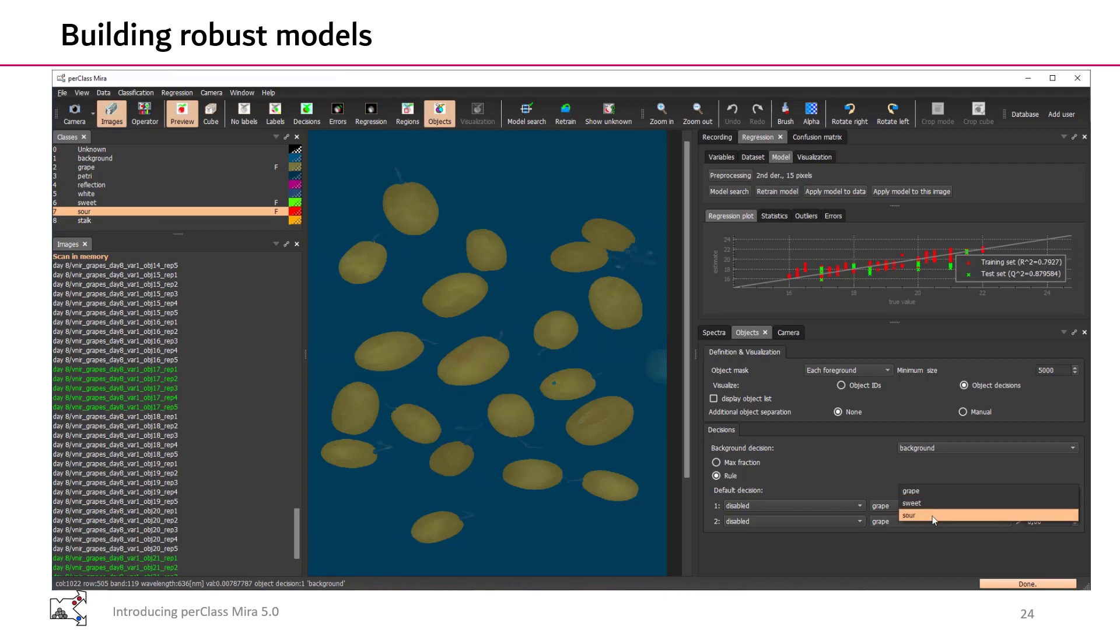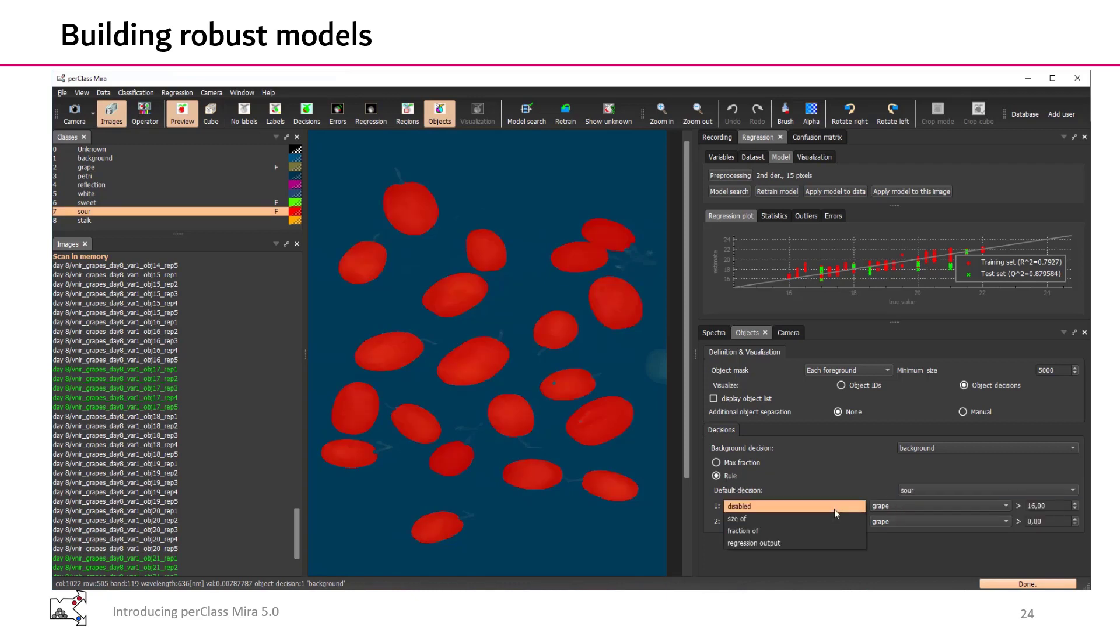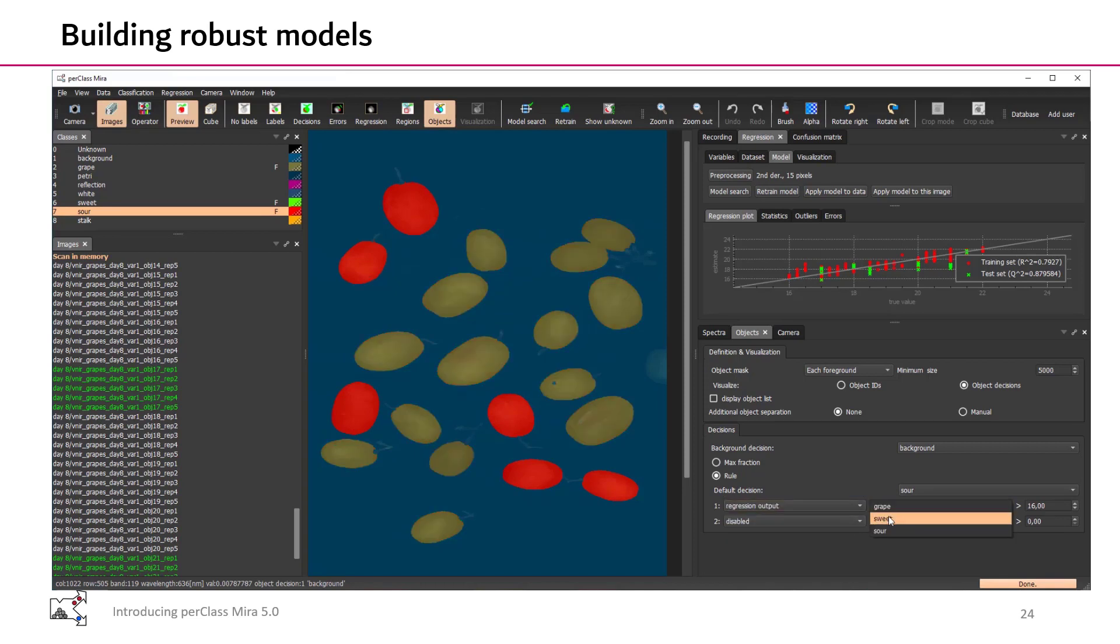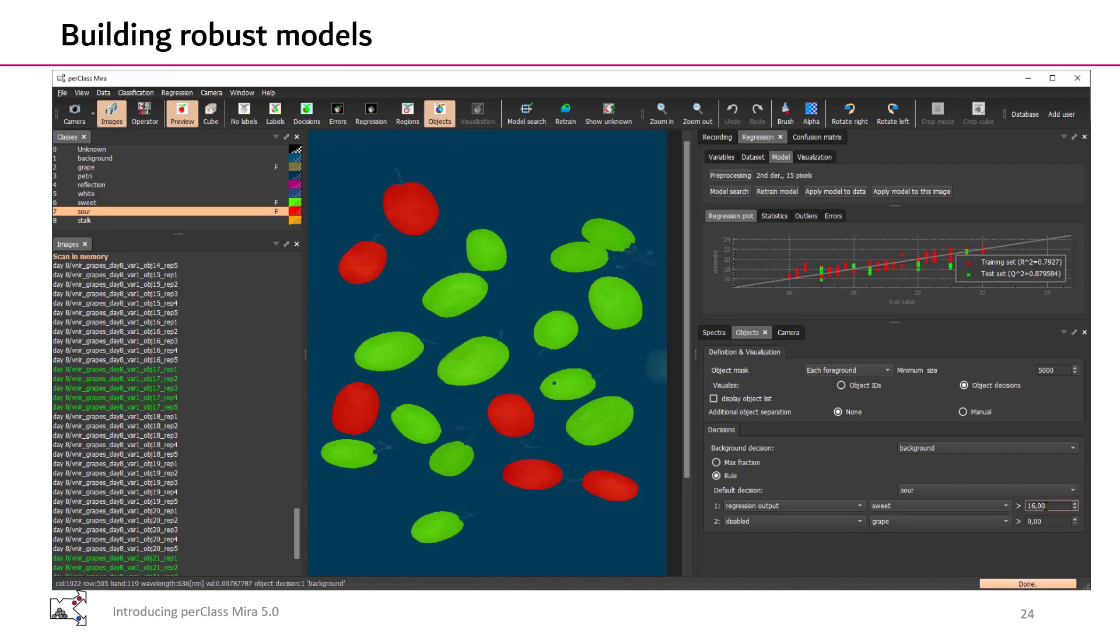And we can set up in the object panel a decision rule that will use these new categories. So by default, the grape will be sour and if the regression output is over certain threshold, it will become sweet. That gives us the decision at the object level and a quick way to see the change when we are adjusting this decision threshold.